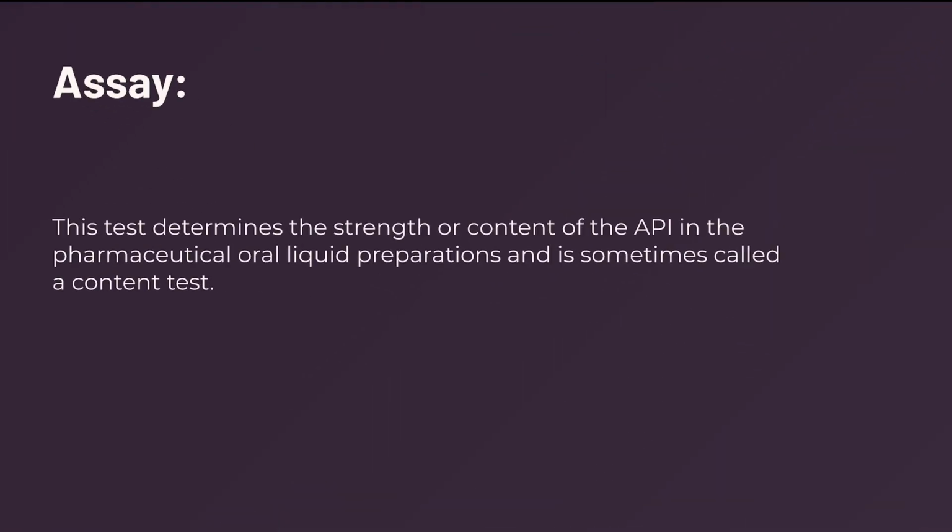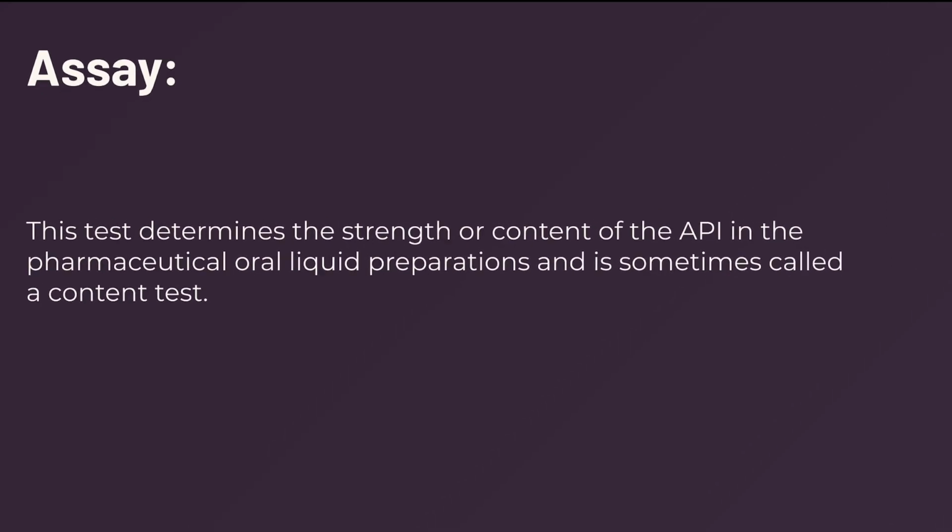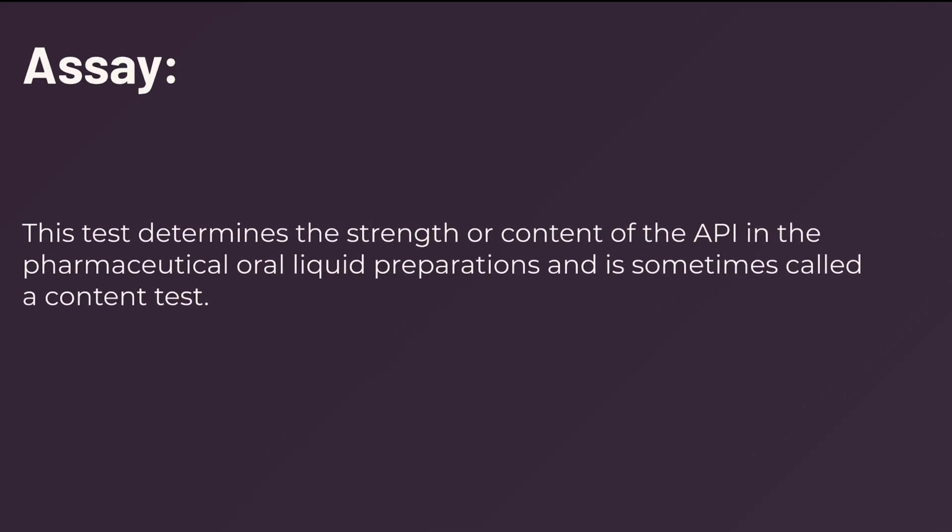Fourth, assay. This test determines the strength or content of the API in the pharmaceutical oral liquid preparations and is sometimes called a content test.